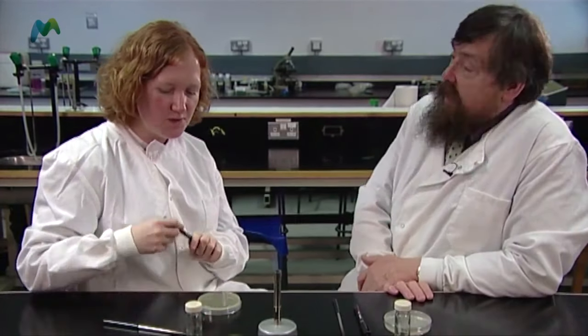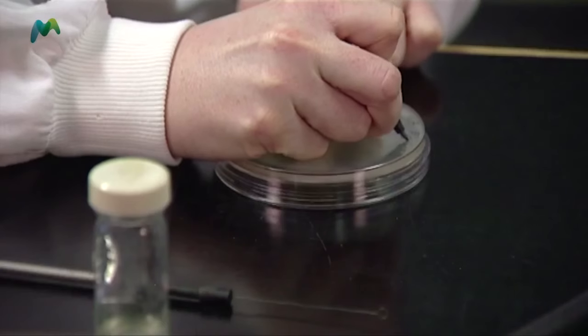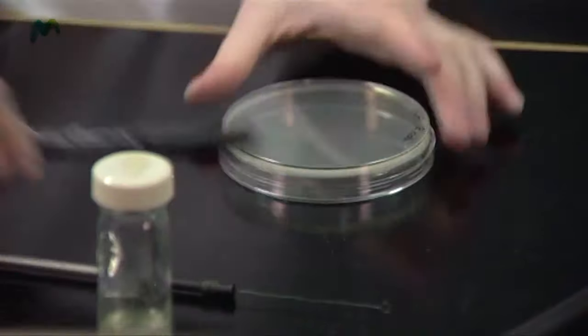I believe you've got a method of producing a streak plate and I've got a slightly different one, so I thought I'd watch how you do yours first. Before we start, I'm going to label my plate — I have an Escherichia coli plate, and I'll just label it with E. coli so we don't get the plates mixed up.